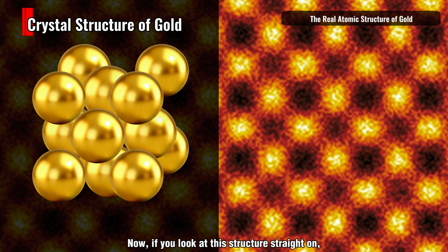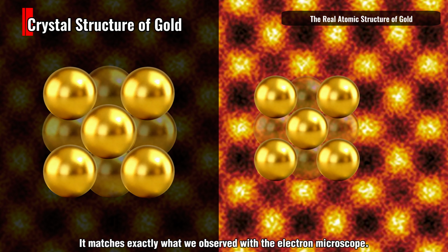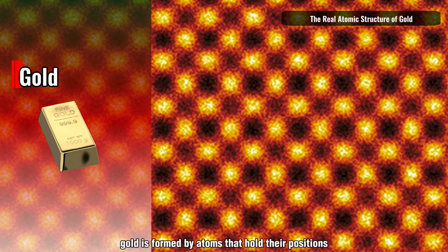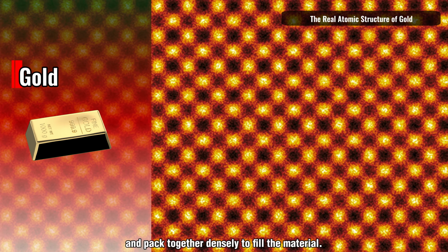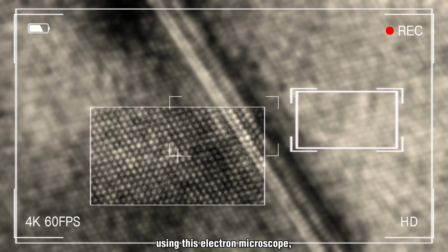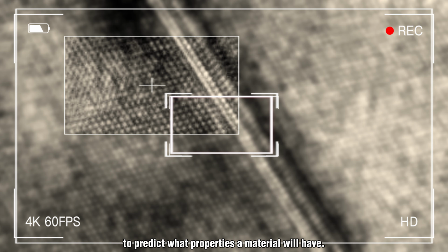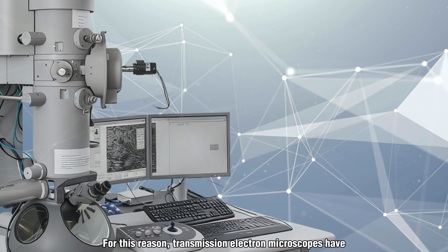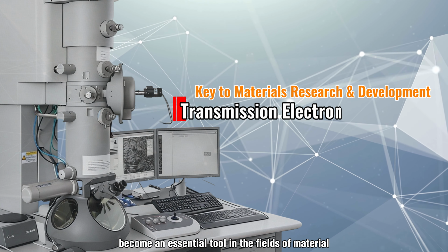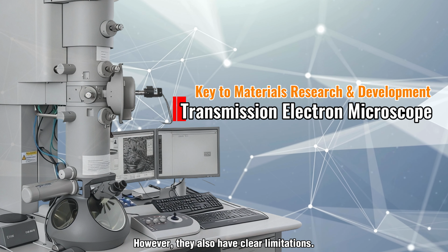Now, if you look at this structure straight on, what do you notice? It matches exactly what we observed with the electron microscope. In this way, gold is formed by atoms that hold their positions and pack together densely to fill the material. And by analyzing materials at the atomic level using this electron microscope, it becomes possible to predict what properties a material will have. For this reason, transmission electron microscopes have become an essential tool in the fields of material science and related research area. However, they also have clear limitations.